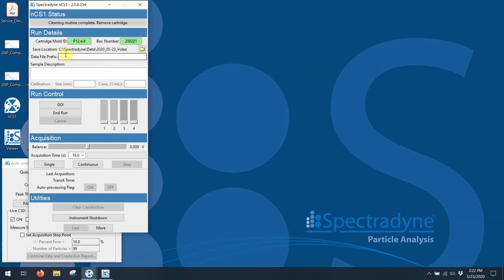At this point, I'm going to put in a data file prefix. We produce lots of data for every run. There are lots of different files, and the easiest way to be able to tell what they're from is to give each data file a prefix. So in this case, I'm going to call it TS-400 bead mix, and I'm going to give it an underscore one just to indicate this is the first run. And every file for this particular run will have that prefix in it.